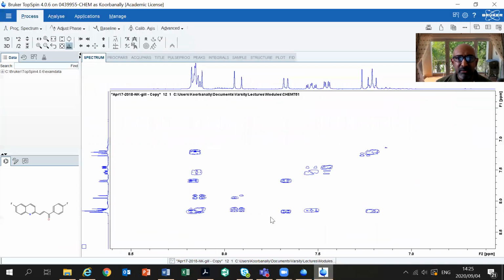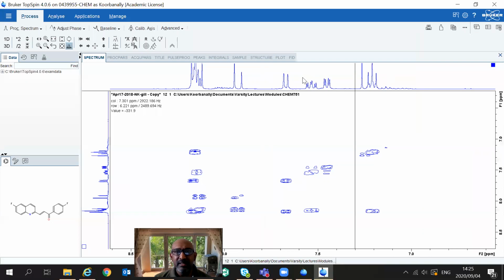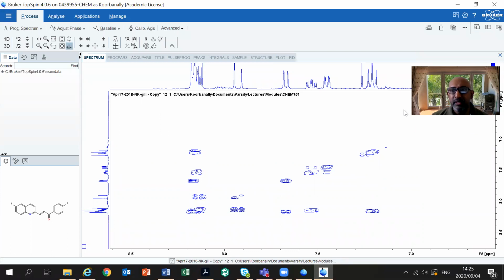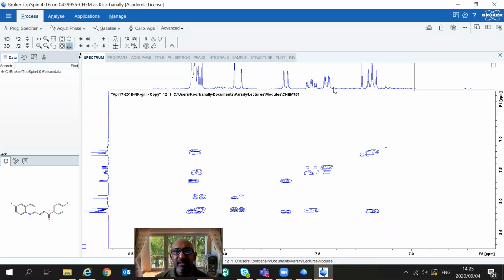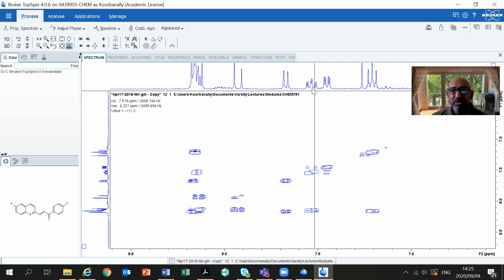And I'm going to jump to the NMR spectrum. Looking at that particular NMR spectrum, can you see this particular peak that I'm looking at? That is your doublet of doublet of doublets that you're looking at here. All right, and I showed you how that comes about.